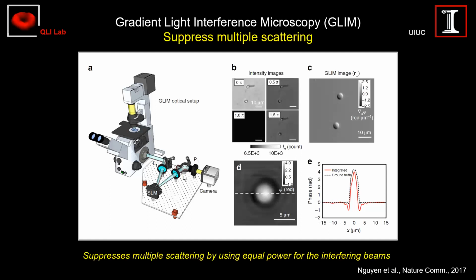So when you look at the difference between these two images, it looks like the difference of a function minus the function shifted, that's approximating a derivative of the phase. That's why we call it gradient, because it extracts a phase derivative, not the phase itself. This derivative we can integrate later, but what comes out of the instrument is a gradient. So you see here, this is a negative gradient, this is a positive, black, bright. So the idea is the same.